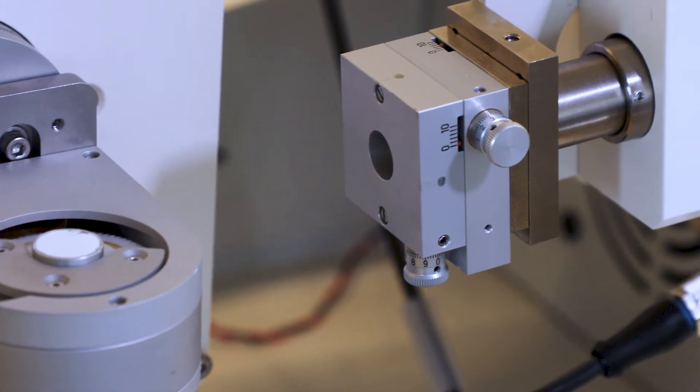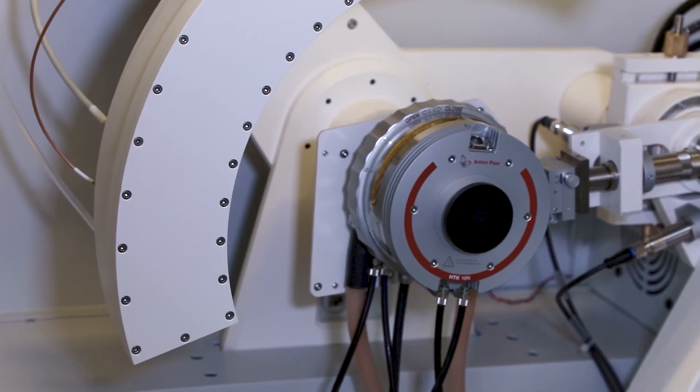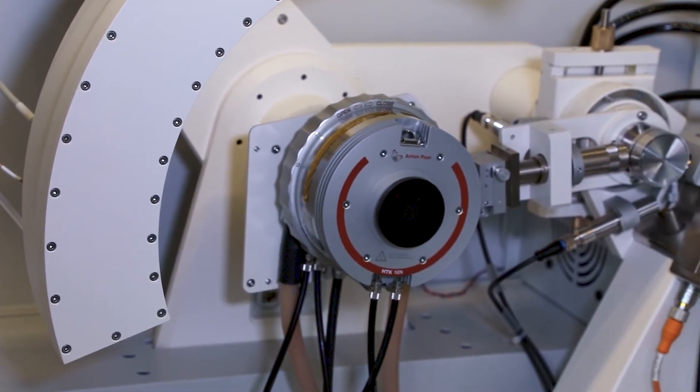The fixed goniometer system with a stationary X-ray source and detector and a fixed focal length means that no realignment is necessary.